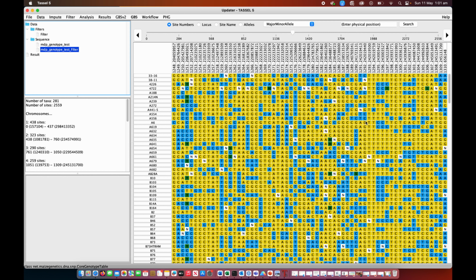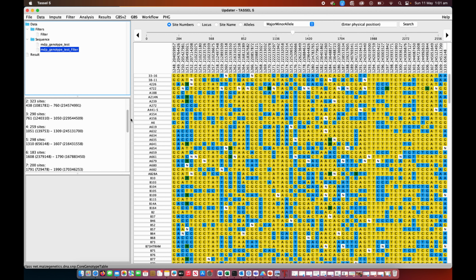Now if you take a good look at the SNPs here, you find that there are a lot of N's, and the N's are unknown SNPs, as you can see here. So if you go to the nucleotide codes under the derived IUPAC, you find that N represents unknown SNPs or alleles. So you want to impute these unknown genotypes, all right, and there are several ways we can impute it. You can impute it within TASSEL here, but I prefer to use Beagle.